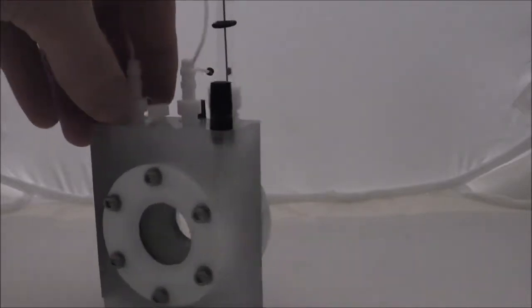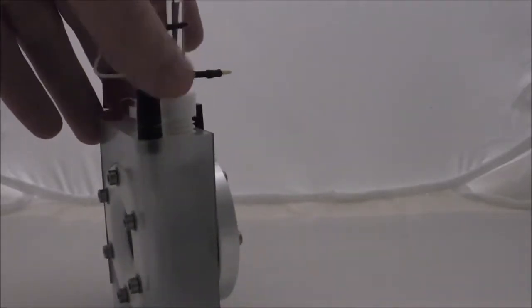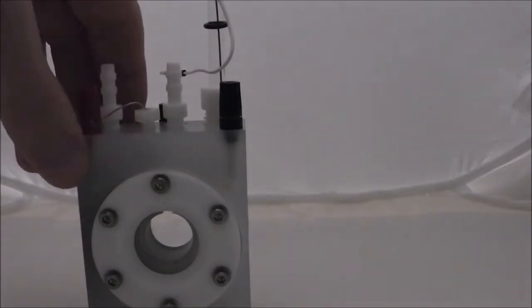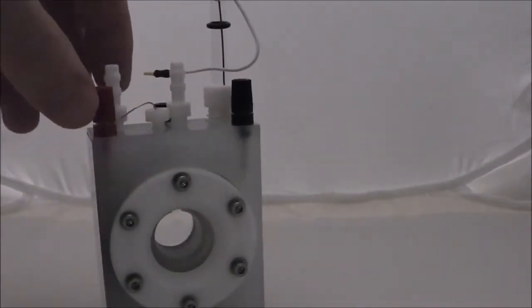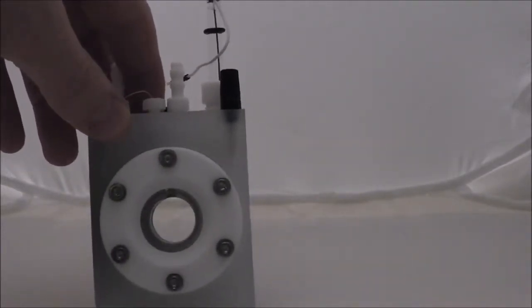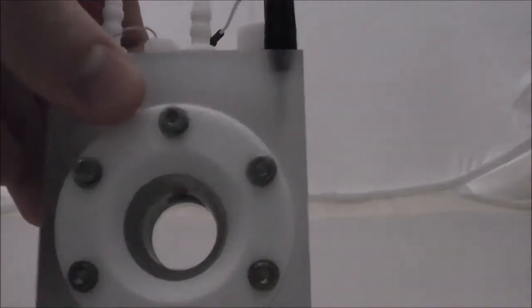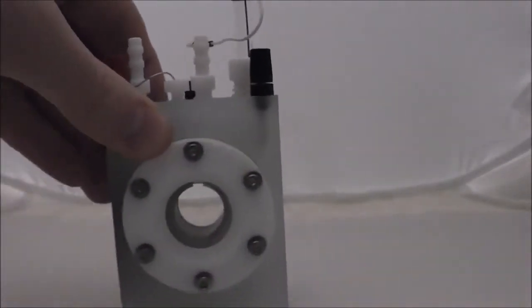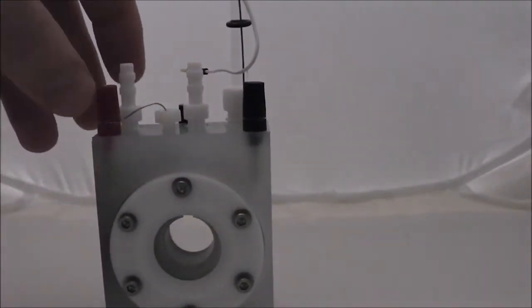We have a port for a reference electrode. By standard it comes with a silver silver chloride reference electrode. There's also a platinum counter electrode within there, and then you can put your own working electrode in there as well.